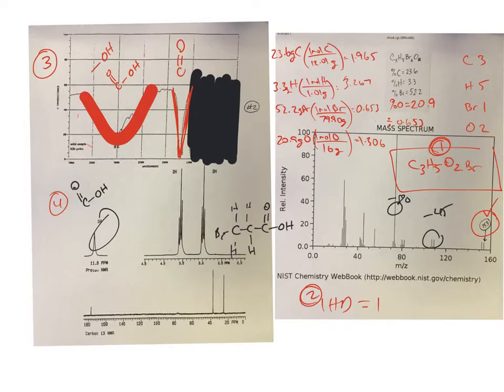So I would just cover that side with your hand or something like that and look to the left of it, 1500 and up. And for me, the two things that I'm going to look for immediately on my IR are traces of, is there an OH? So that big wide group around 3000, right? It's going to be really big and wide if it's a carboxyl group, and a little lower in numbers. It's going to be a little bit less wide and blobby and maybe smoother and up a little higher in numbers, maybe even all the way up to 3,500-ish if it's just an alcohol. So you can get a lot of information there.